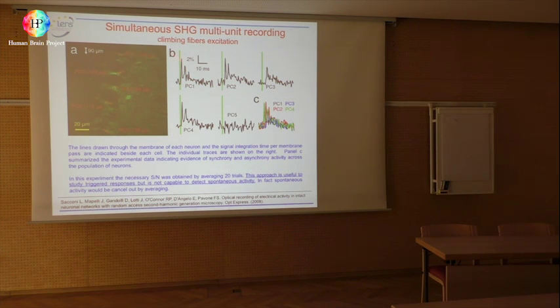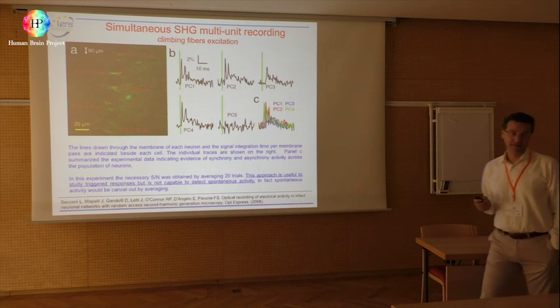Because these are excited by climbing fibers, and you know that in the cerebellum, when you have climbing fiber excitation, you have a complex spiking, okay? And you see here that you can study synchronizations very well, with very, very high precision, between those cells. Okay? Now, there is a drawback.